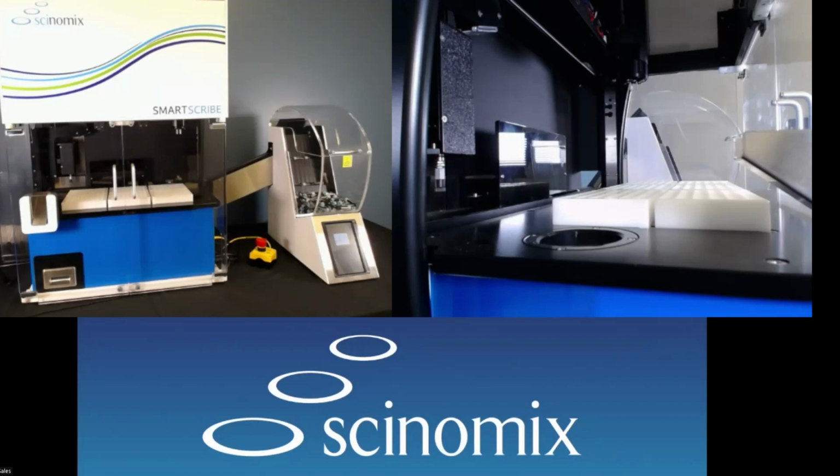On the right-hand side is a closer inside view of the instrument. As we process this run, you will see the tubes come down to the VXI pick and place, be presented to the gripper. The gripper will place that into the laser module, and then once the tube is processed, the gripper will place the tube into the racks.